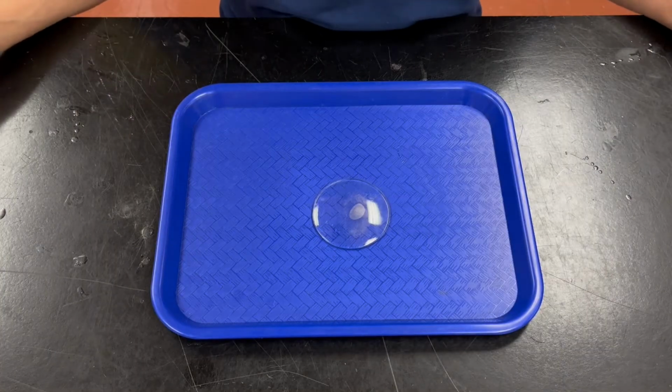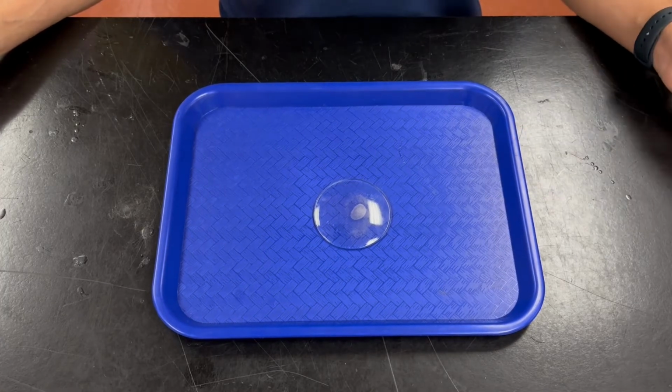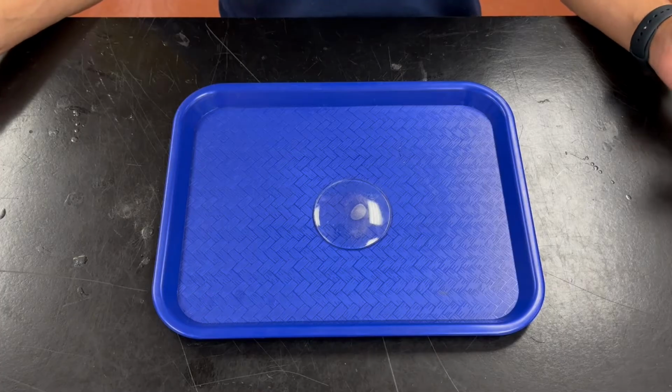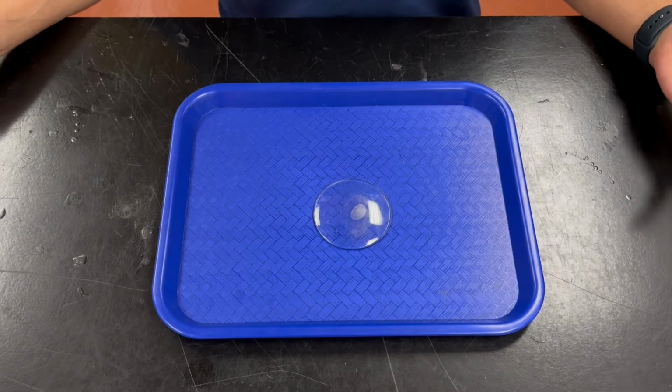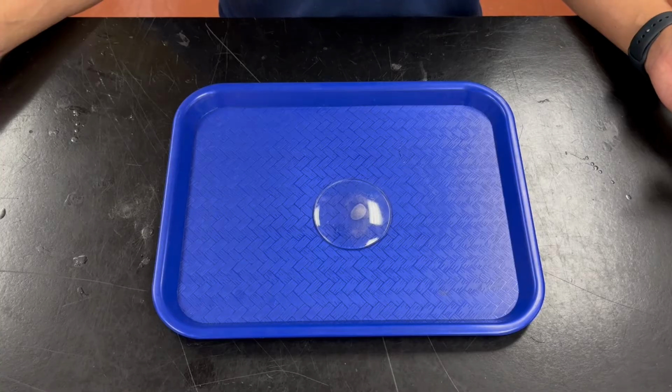Kind of a change of scene, I know. I just changed to this tray instead of the paper because in the case of the paper, when I place my collecting tape on top, I might risk the tape getting stuck to the paper. So I want to make sure that this surface that I'm using right now won't stick to my collecting tape, because that could possibly ruin your fingerprint as well.